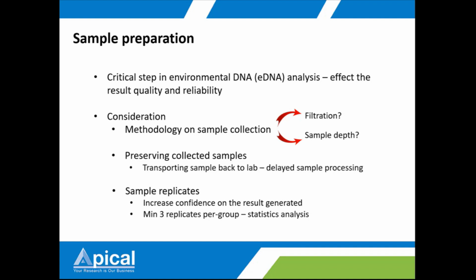There are a few considerations, for example the methodology of sample collection. For example, if you go to the sea and want to collect a water sample, filtration is needed, right? When you filter the water, what type of filter paper do you use? Is this filter able to capture the organism of your interest?